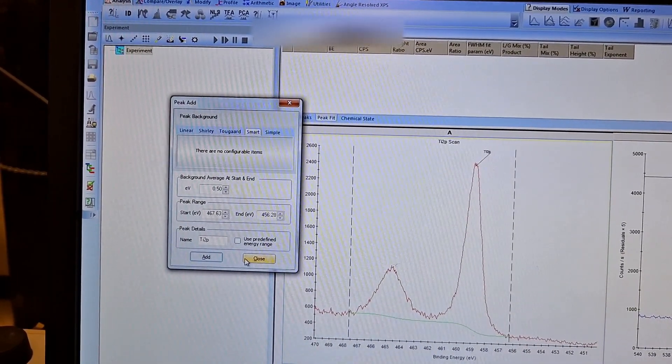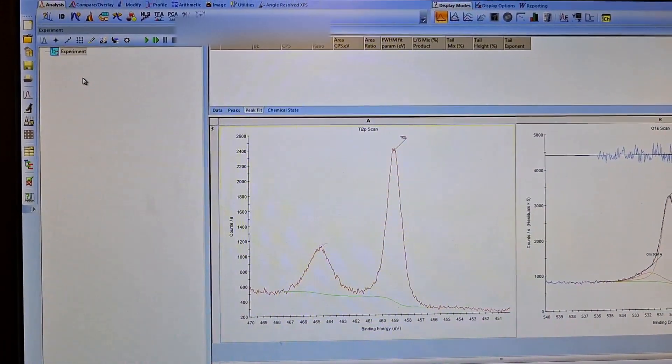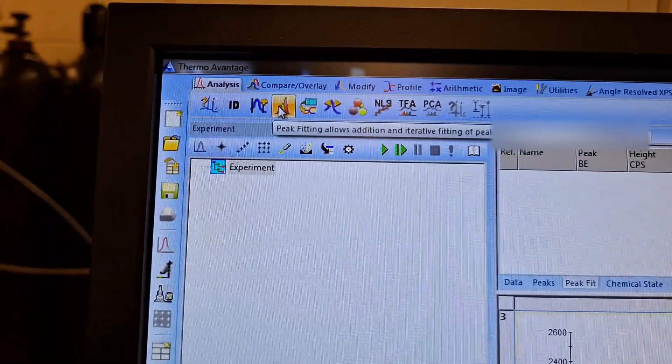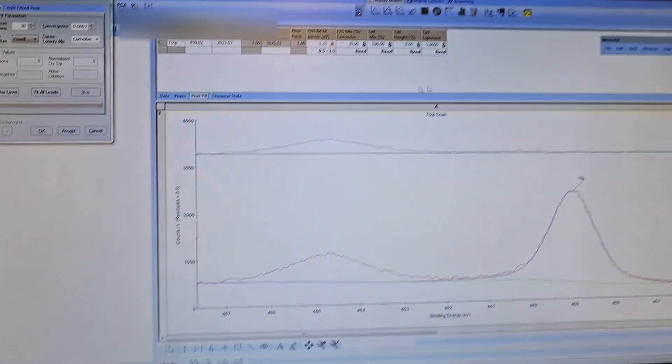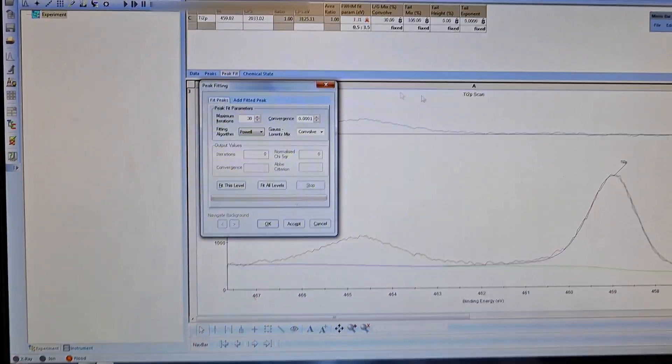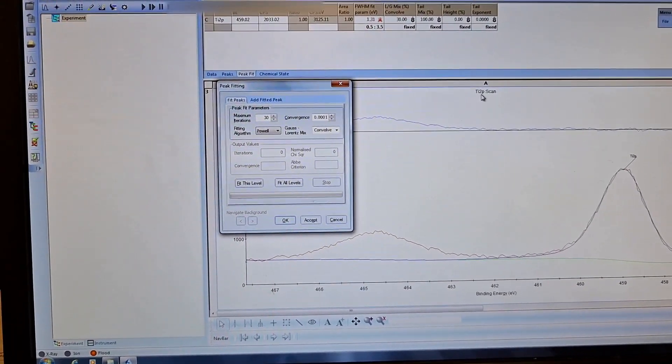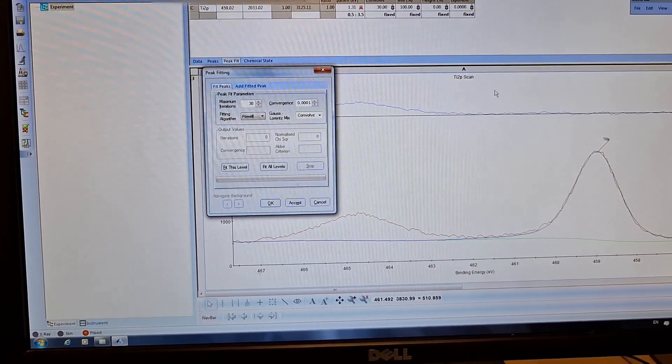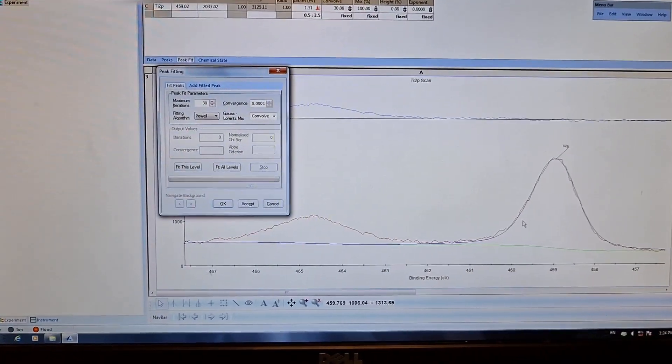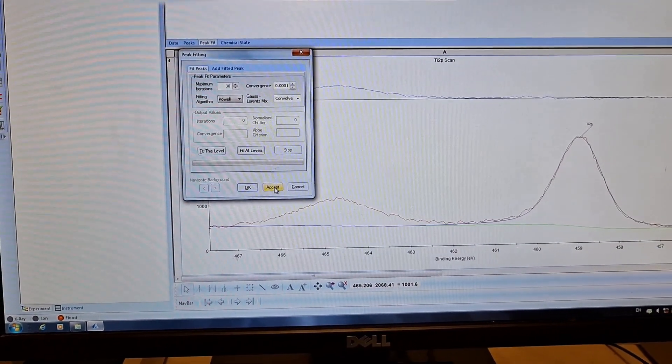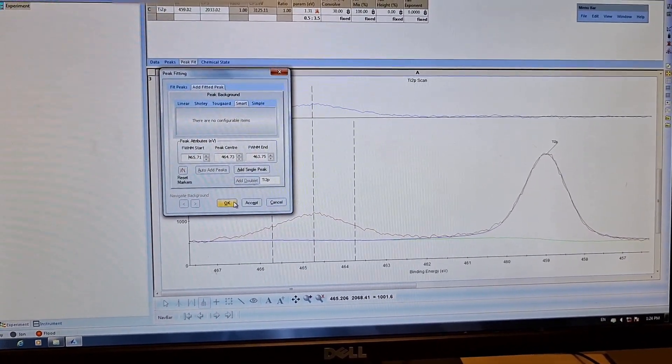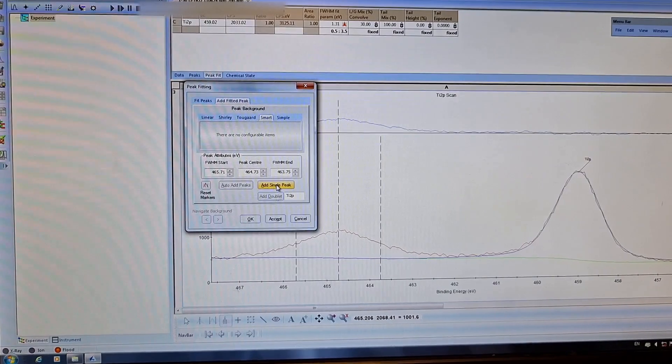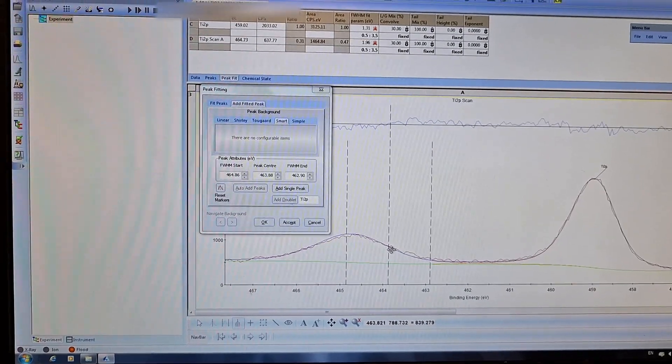I will close it, then add peaks. I have to click this thing. It automatically adds one peak. There should be titanium 3+ and 4+. As you know, 4+ binding energy is higher, so it should be around here, and the titanium 3+ should be around here. I want to add a single peak.